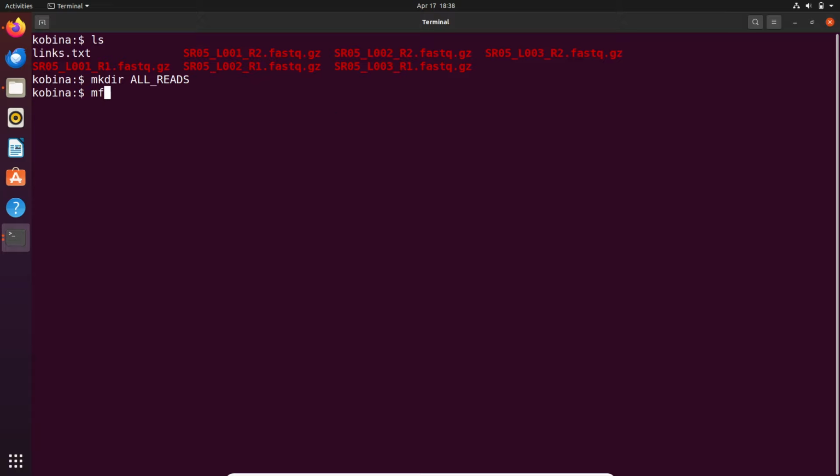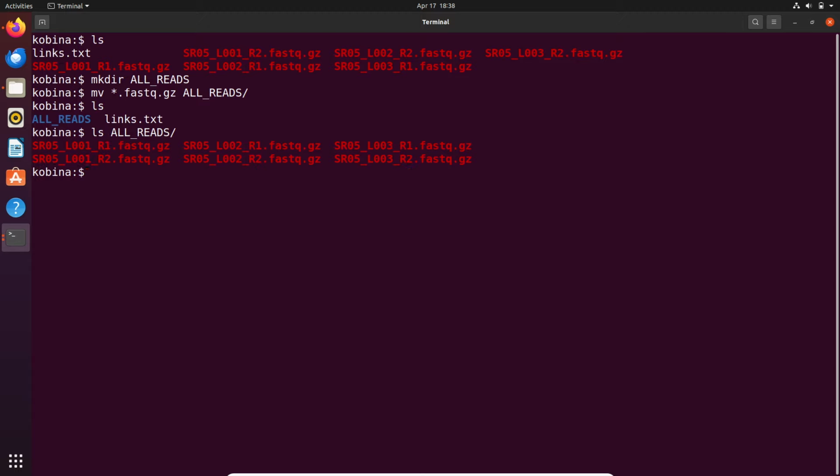So I'll say mv star .fastq.gz all reads. Now if I do an ls, nothing is here. They are all in the all reads. So ls all reads, we are going to find them there. Now we are starting the main show.